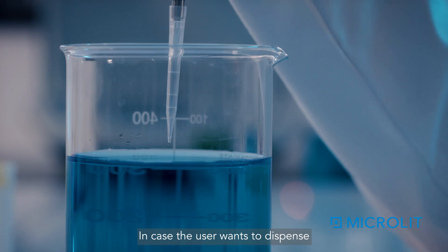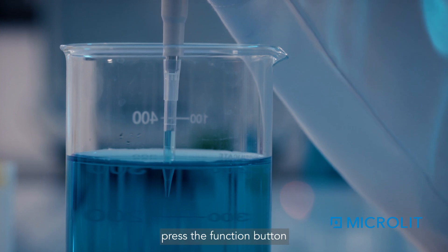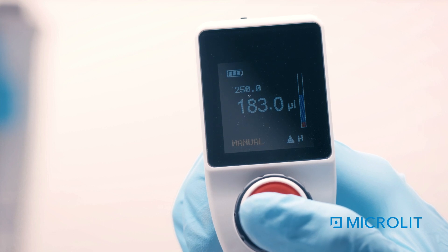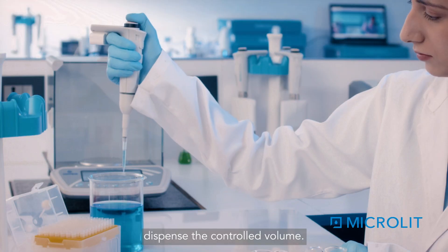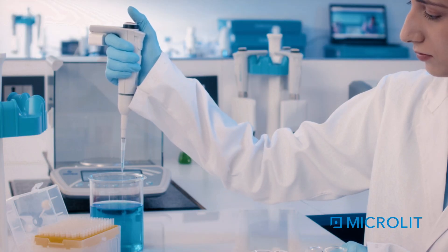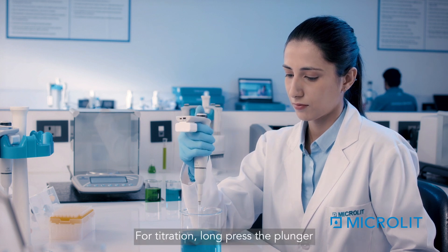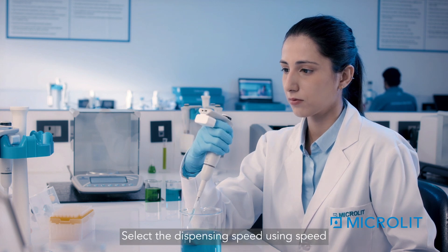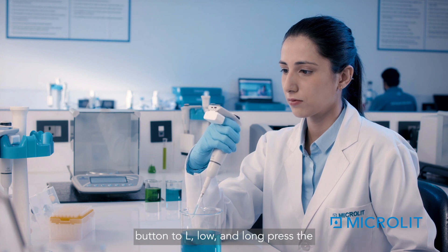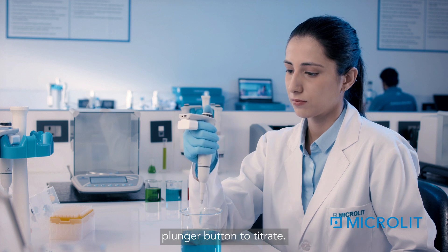Long-press the plunger button to dispense the entire liquid. If the user wants to dispense a controlled volume after aspirating, press the function button to switch to Pipette Mode and simply press the plunger button to dispense the controlled volume. Manual Mode can also be used for small titration: long-press the plunger button to aspirate the desired volume, select the dispensing speed using the speed button to Low, and long-press the plunger button to titrate.